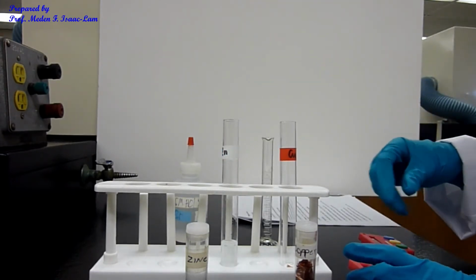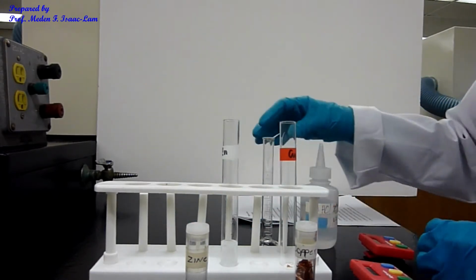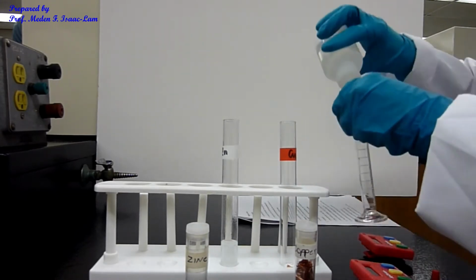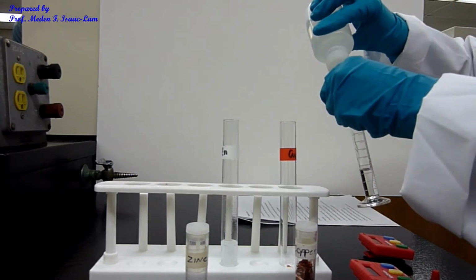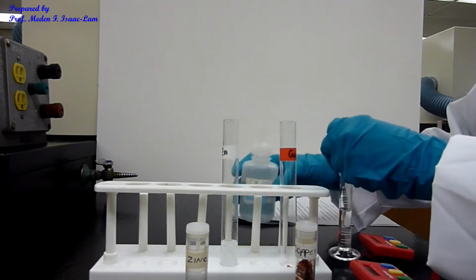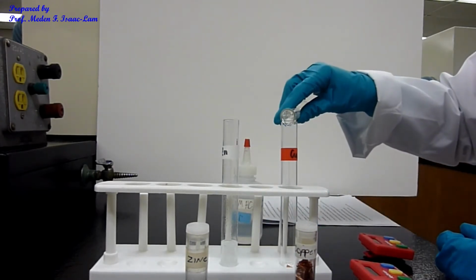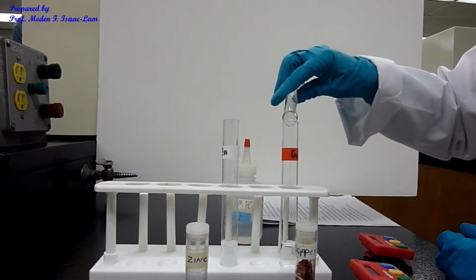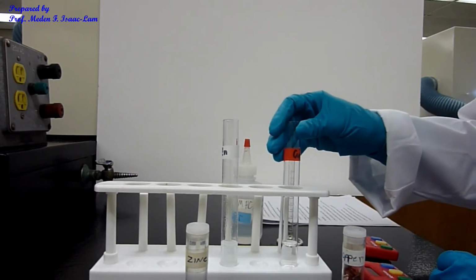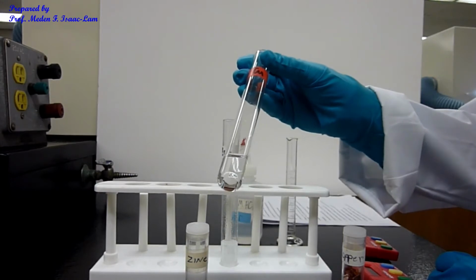And then I'm going to put the same amount of hydrochloric acid, the same 5 ml, in the copper. Nothing is happening.